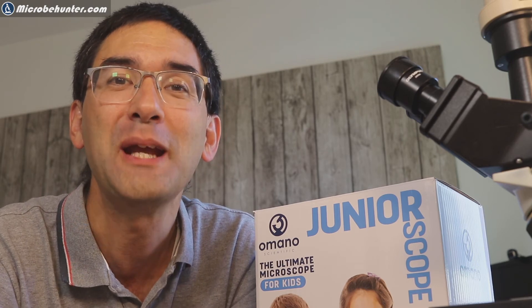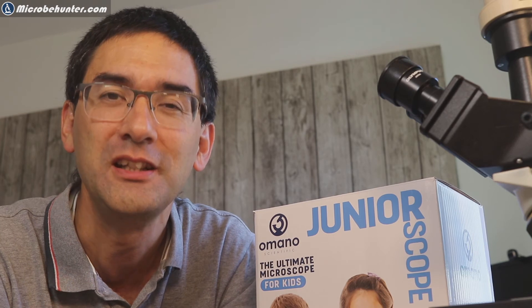But as I've showed you I was even able to do an image stack so it is possible to focus very precisely, you just need to be a little bit, you need a steady hand for that. And a second difference is that this microscope has also top illumination.